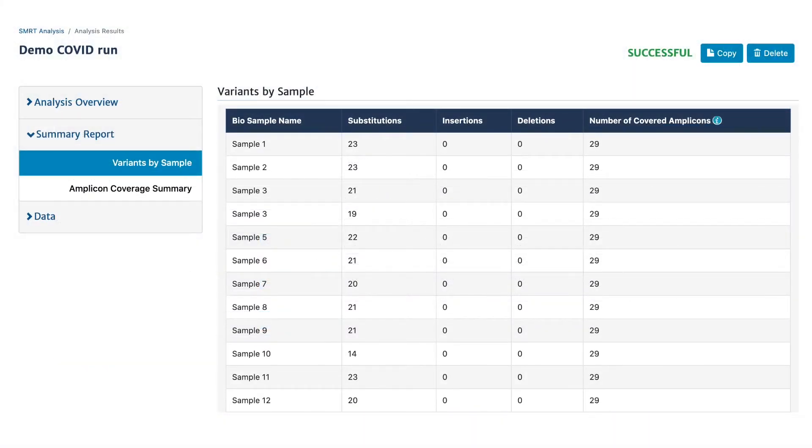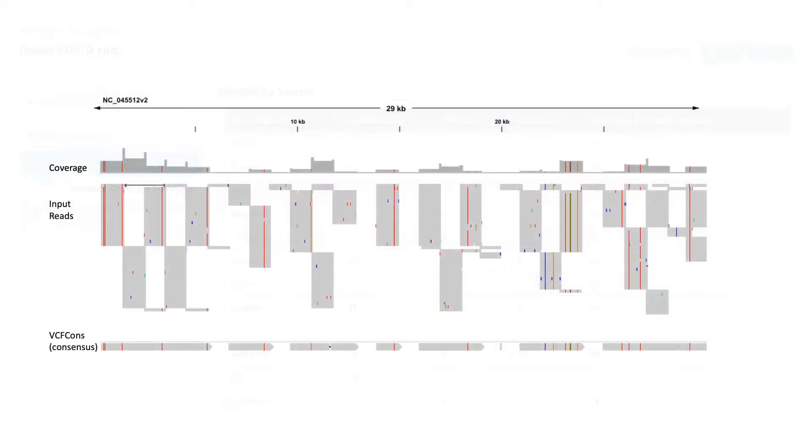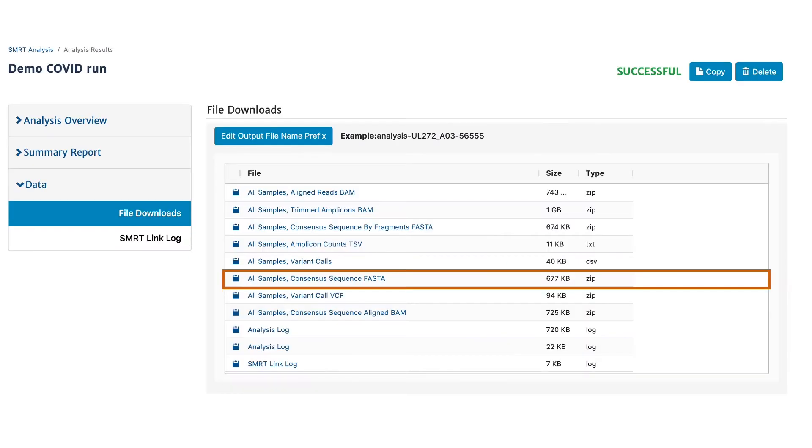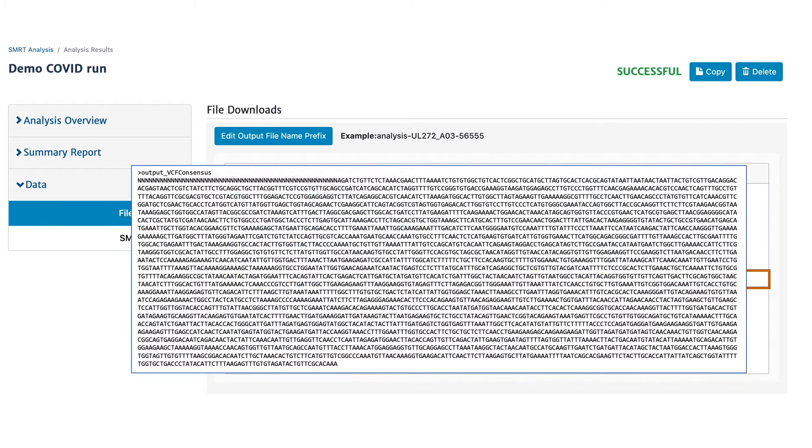With this workflow, you can identify variants, visualize the variants across the whole genome, and obtain per-sample consensus sequences that you can submit to GISAID or GenBank.